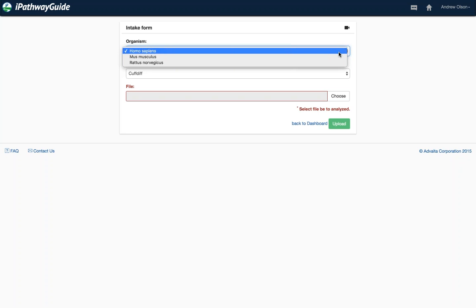And I think you can probably put the breadcrumbs together, and you can see in our pathway analysis we have that section where you can model the SNPs or the variants directly on the pathways. We will eventually build that bridge across both the gene expression as well as the DNA analysis pipelines.